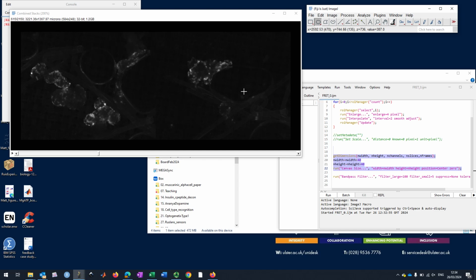What it does, the process is called registration. What it does effectively is aligning every image with its predecessor, using the predecessor as a pattern. So in case there was some motion, for instance, if a cell has moved laterally, it will try adjusting that, compensating for the motion in this way. I'll pause the video in the interest of time, and then I'll get back when the registration is over.